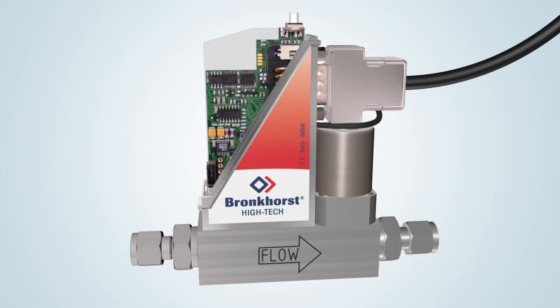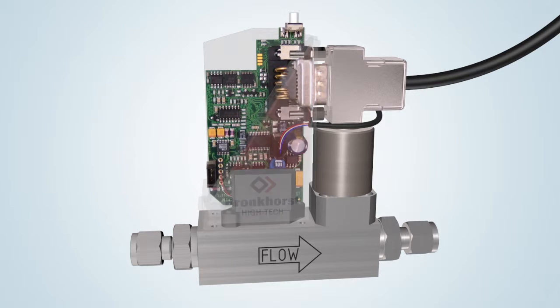Under the cover of the L-Flow MFC are the electronics made using SMD technology.